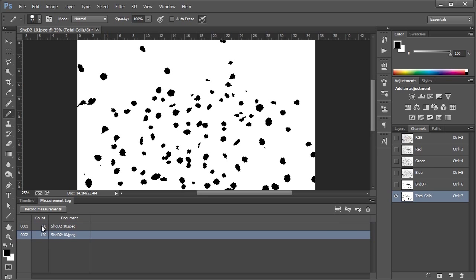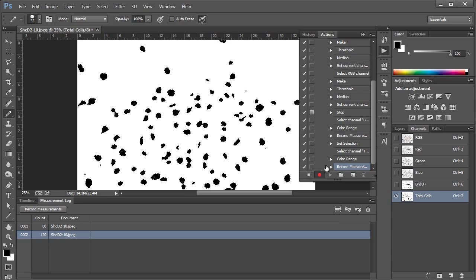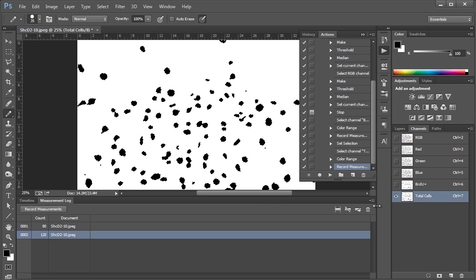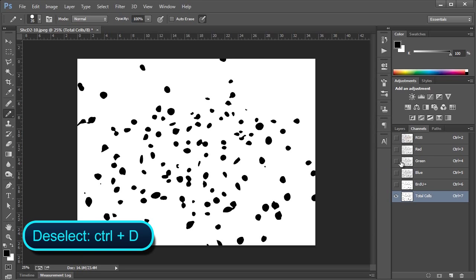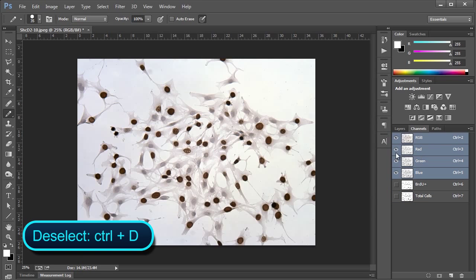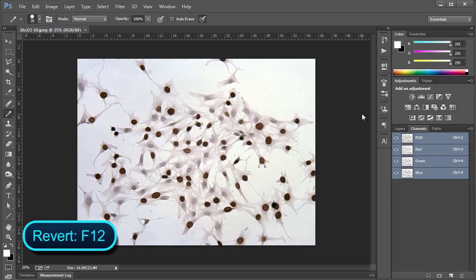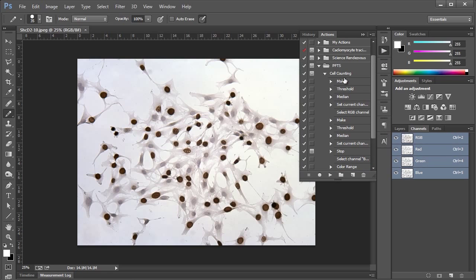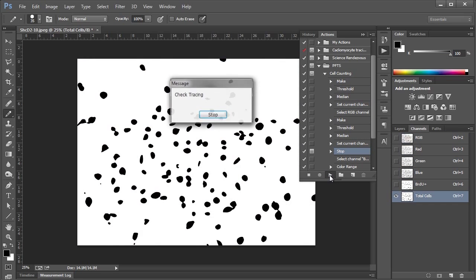So there you have it. There's our BRDU positive cells and our total cells. So we can go and stop our action. Let's close this down for now. And I'll deselect again. And that should be it for the action. So what I'm going to do is revert the image here to when we first started. I can do that by pushing F12. And the action will stay right where we left it. So just to give you an example of how it works, we click the title of the action, which is Cell Counting, and click the Play button. So now it's going to go through these steps automatically.